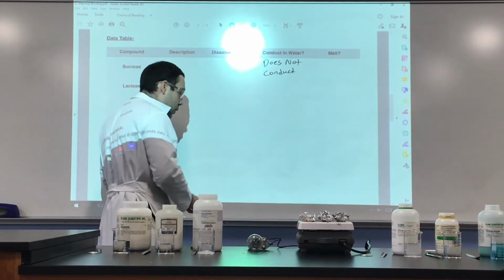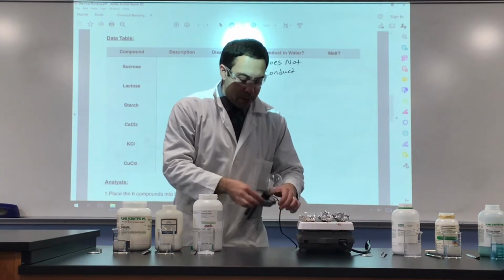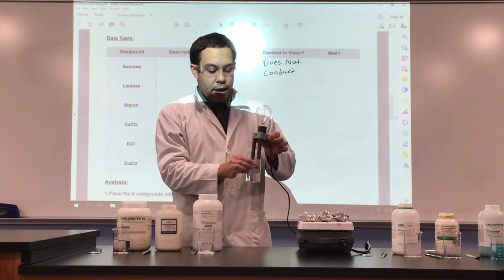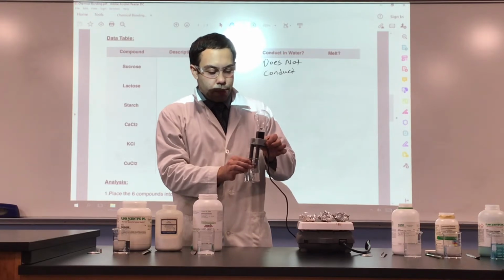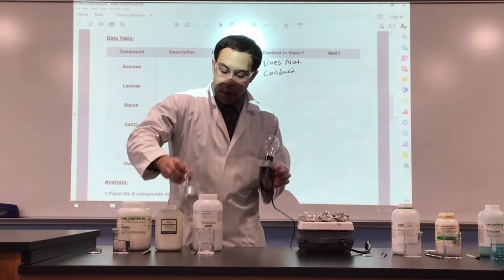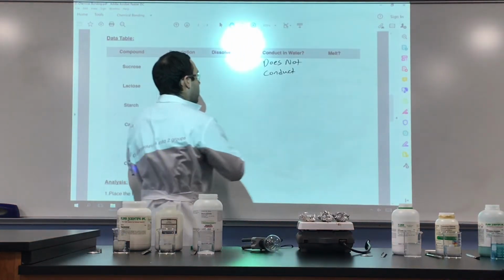Next is the lactose. Same procedure. We take the light bulb. We place the electrodes in solution. The light bulb remains off. The lactose also does not conduct electricity.